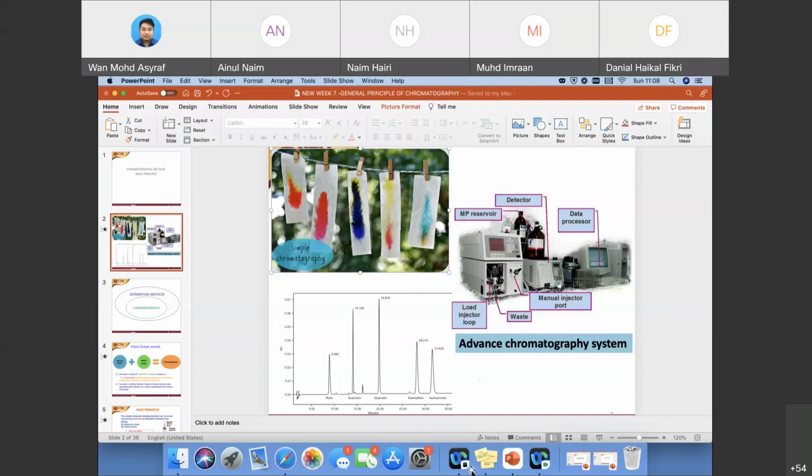So basically, before this, we have looked into a spectrum, a spectroscopy spectrum. So now when we learn about the chromatography method, we don't call it a spectrum anymore. We call it a chromatogram. Okay, it's just the same thing. Okay, so basically based on this chromatogram, the one at the bottom, you've looked at that, and then you saw that inside this sample, it has been separated into 1, 2, 3, 4, 5 components inside your sample.